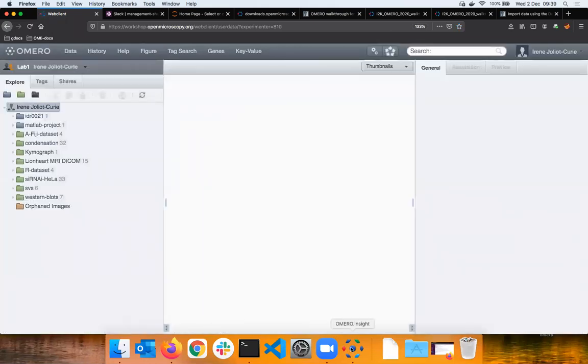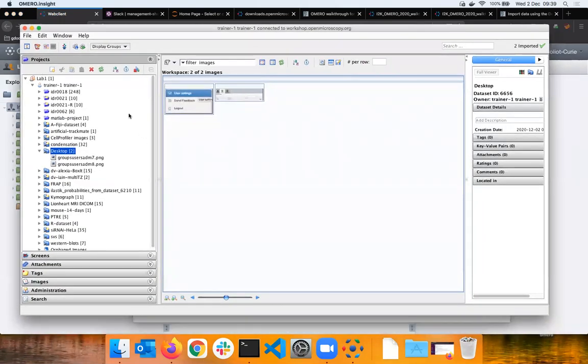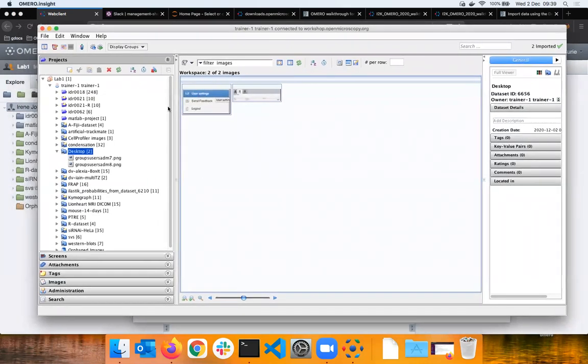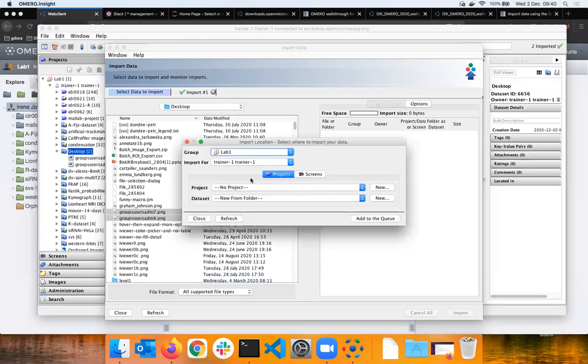And I will now again imagine that I'm trainer 1 using another client called OMERO.insight, yes? And I will do another import, but this time I will not import for myself. I will import for a user called Irene Joliot-Curie, okay? This is user 50, as I remember.